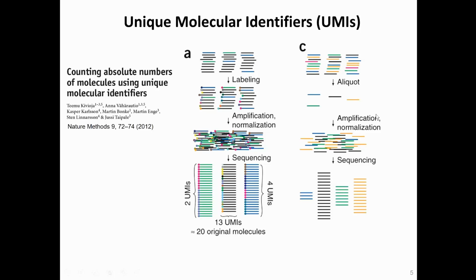Now, RNA-Seq has a lot of advantages over hybridization-based methods, mainly in that you can get very high sensitivity. You can see very low count species of RNA, and also because you have the sequence, you can look at variations in both transcripts and very minor sequence changes in your RNAs.